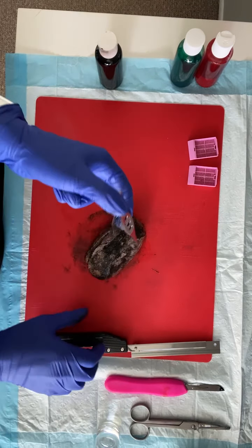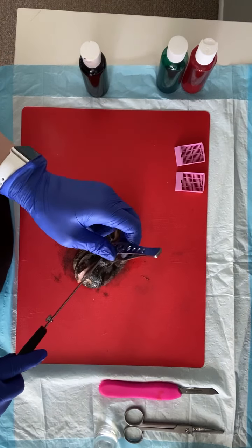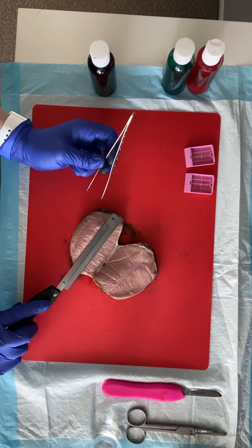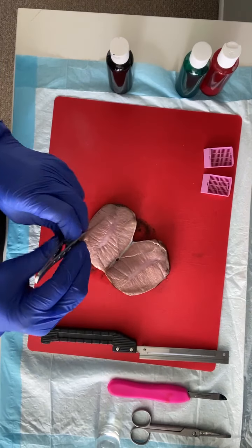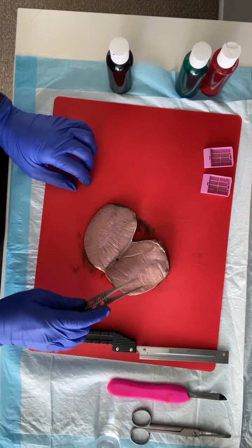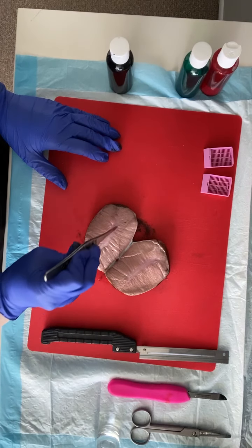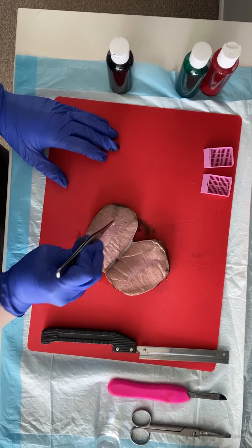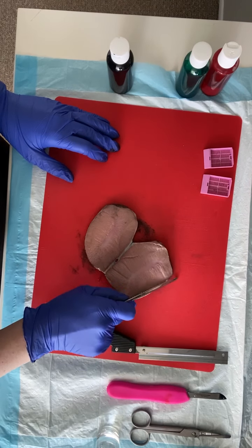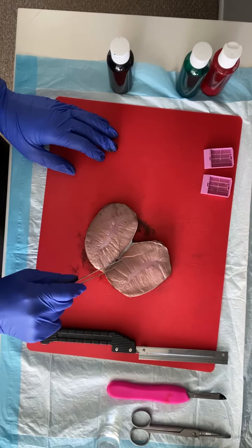I have the tiniest little forceps in my at-home grossing kit. Using a medium blade, we're going to bivalve — the albuginea is kind of tough to get through. This is our testicular parenchyma. On a human specimen the epididymis would be right here, and then our spermatic cord would be coming up here. We've bivalved through our specimen — you can leave it attached. You can see the albuginea in here. These sheep testicles have white fibrous tissue in the medial aspect; you would not see that on a normal human specimen, unless there's a history of cryptorchidism or anything like that, which can cause additional fibrous tissue.